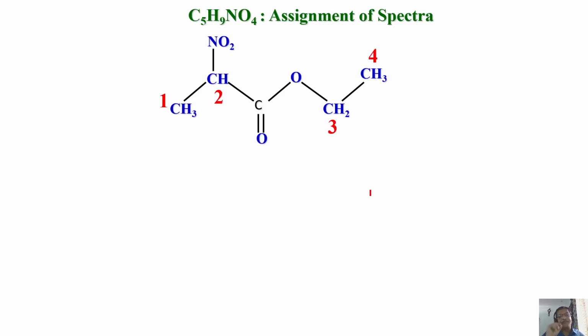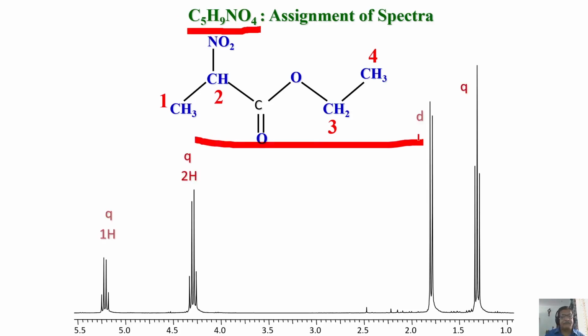We are looking at the next spectrum of a molecule like this. The formula is known, and this chemical structure is also given. This is the NMR spectrum. Your life has become very simple because everything is marked. In this case, absolutely no need to spend more than 1 minute to analyze the spectrum. Maximum 2 minutes. Analysis is simple. You know how?